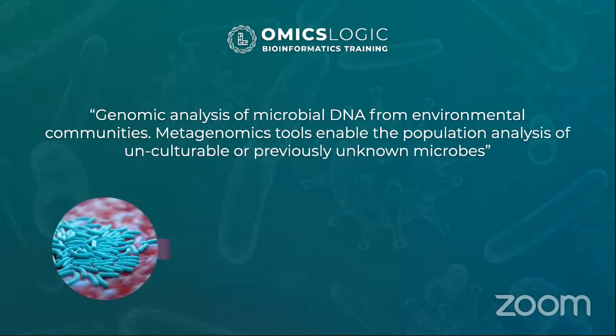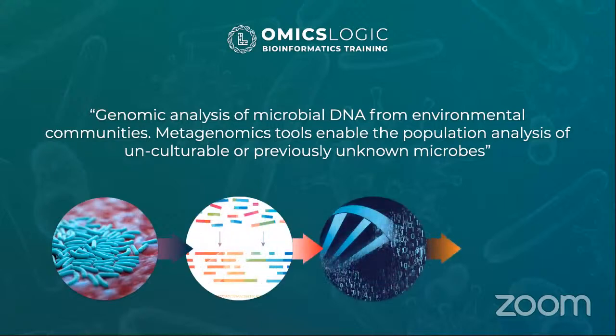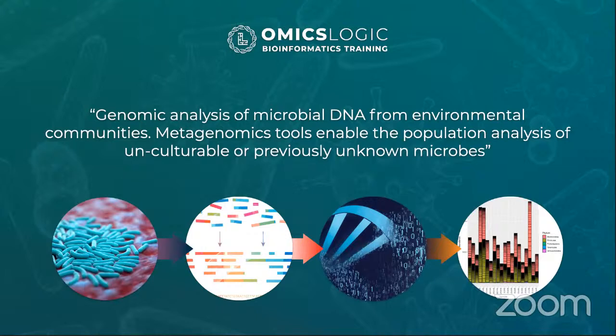The essential steps here are to understand, when we have a community that can be comprised of millions of individual microorganisms, how can we use an effective approach to sequencing the genomic information about these communities to characterize the composition, dominance or species richness, and the interaction between the microbiome and their environment, forming specific conditions that have a major contribution to our human health as well as the environment.